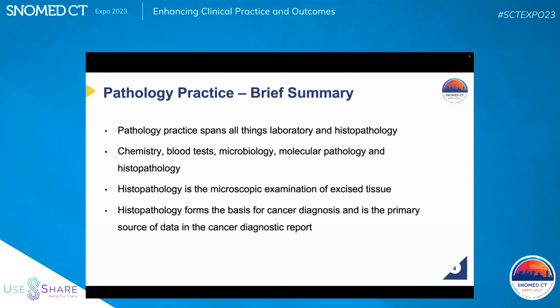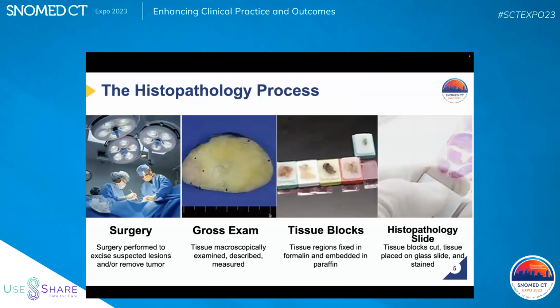Radiology can say, yeah, that looks bad. There's lots of things that in the clinical domain we can say is bad, but ultimately we pull out pieces of tissue and say, yeah, it really is bad. This really is malignant. It's nothing shy of that. So, all right, that's the histology practice. And so Eric here is a pathology assistant. You could ask him about gross room stuff when we get to gross room things.